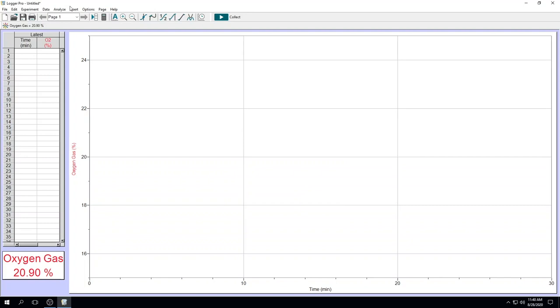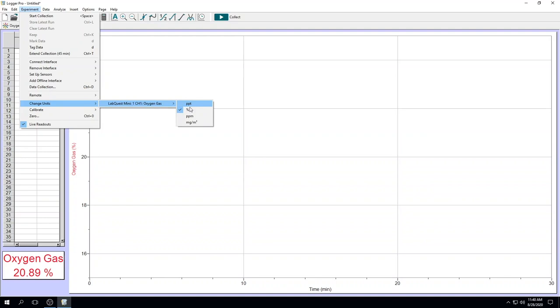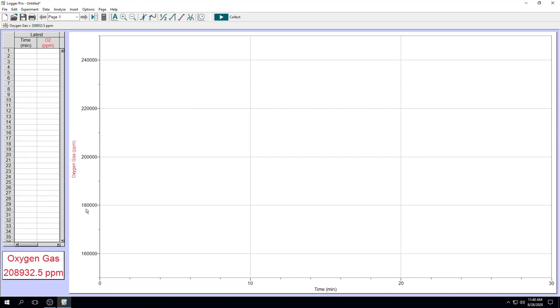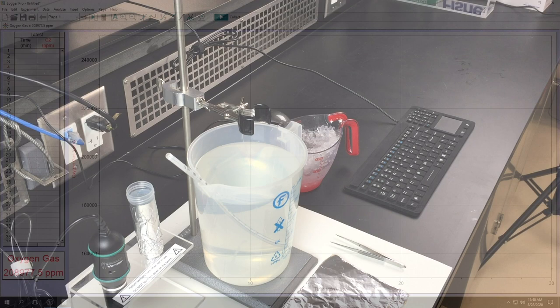With the last step, under experiment, change unit. The unit should be changed to ppm or parts per million. You should see a change in the unit and the values right here on the bottom left corner of your screen.